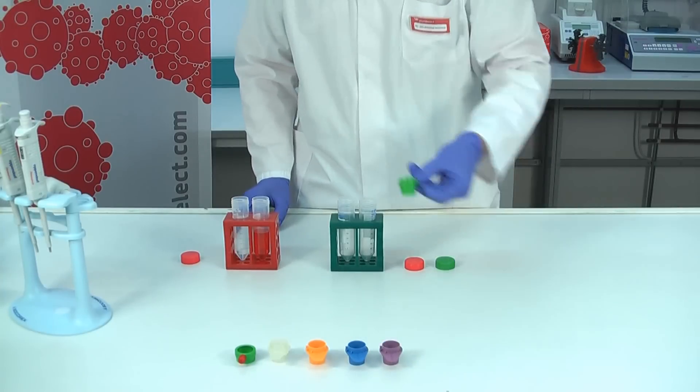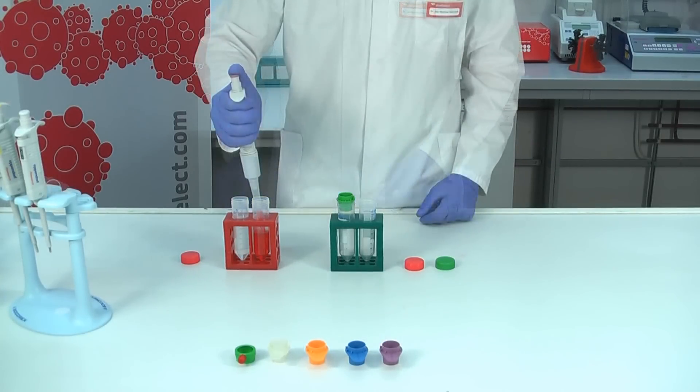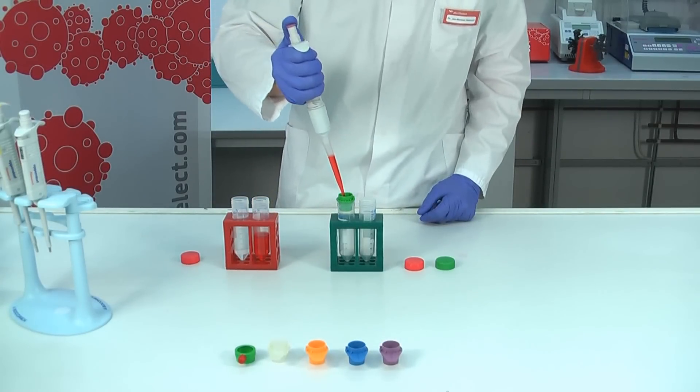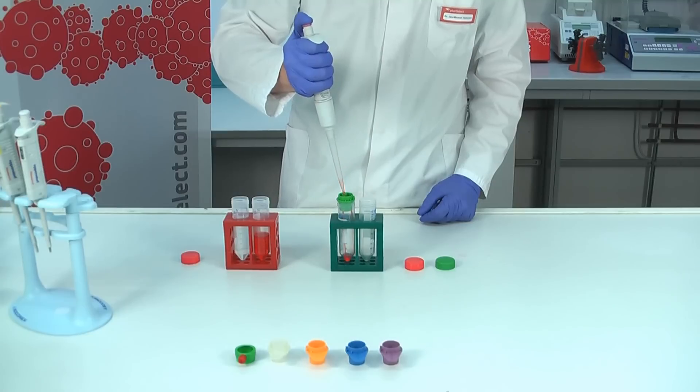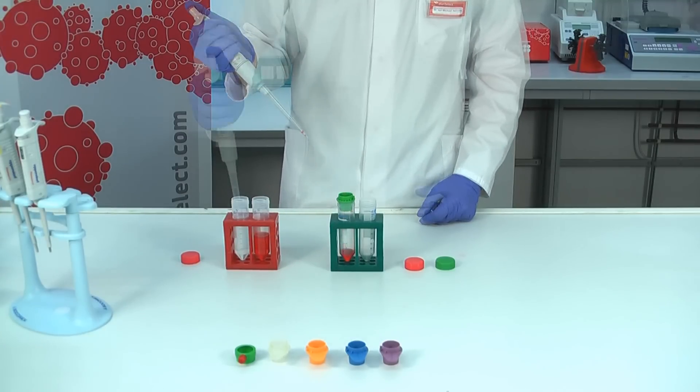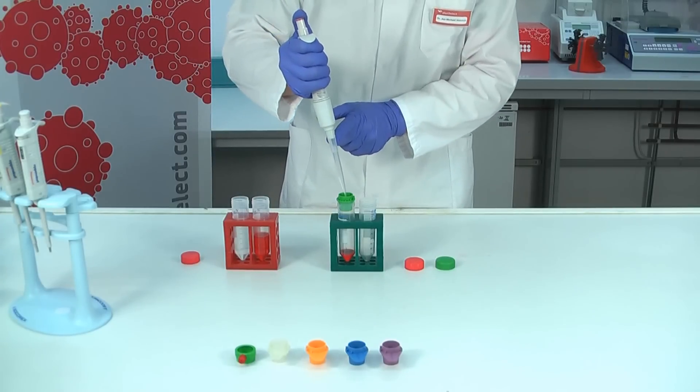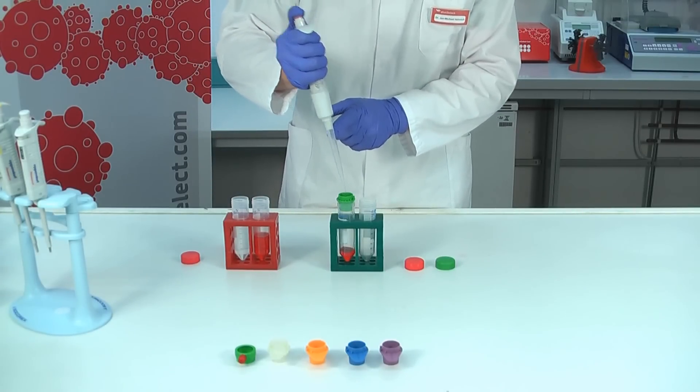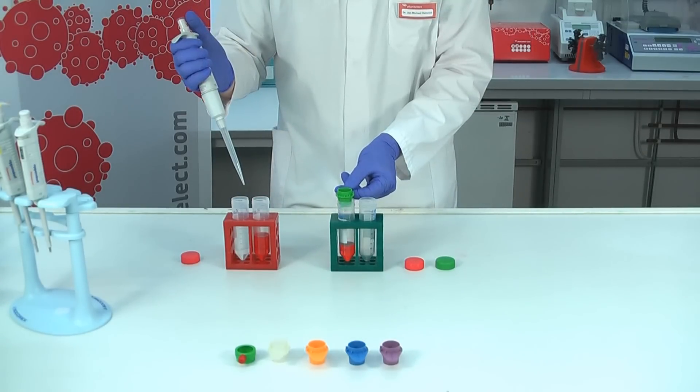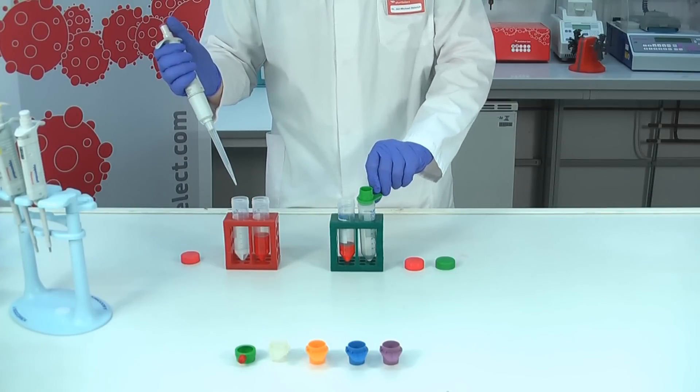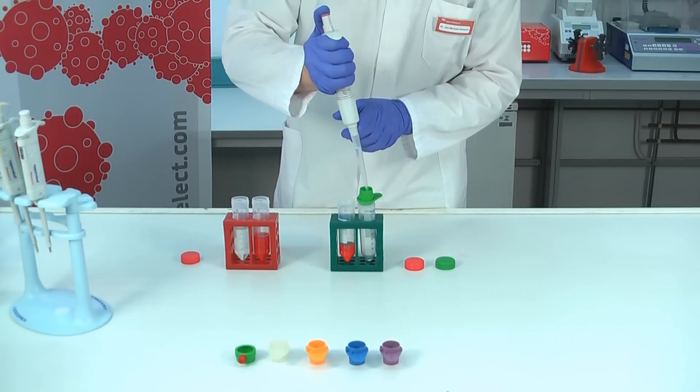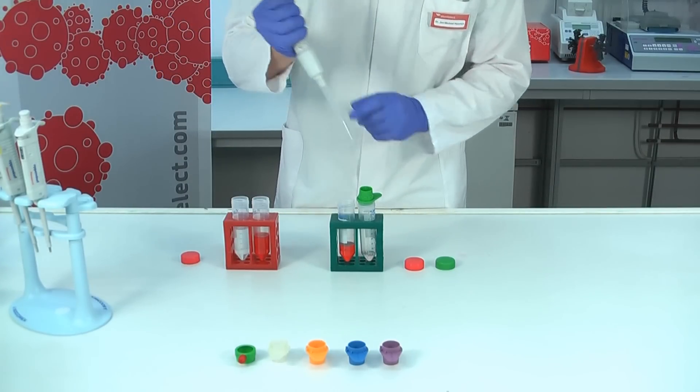Plug the pluriStrainer on a 50ml tube. Add your sample material and then wash with buffer. Now you can take off the pluriStrainer and turn it upside down on another fresh tube. Add some washing buffer, and your strained cells will run into the tube.